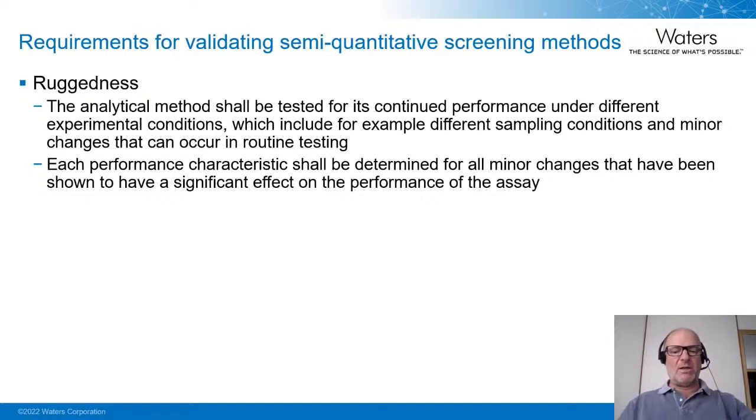The idea is to document and evaluate whether any of these small changes have a significant effect on the performance of the assay. The regulation does not provide any details of acceptance criteria, it just says you have to check for ruggedness.